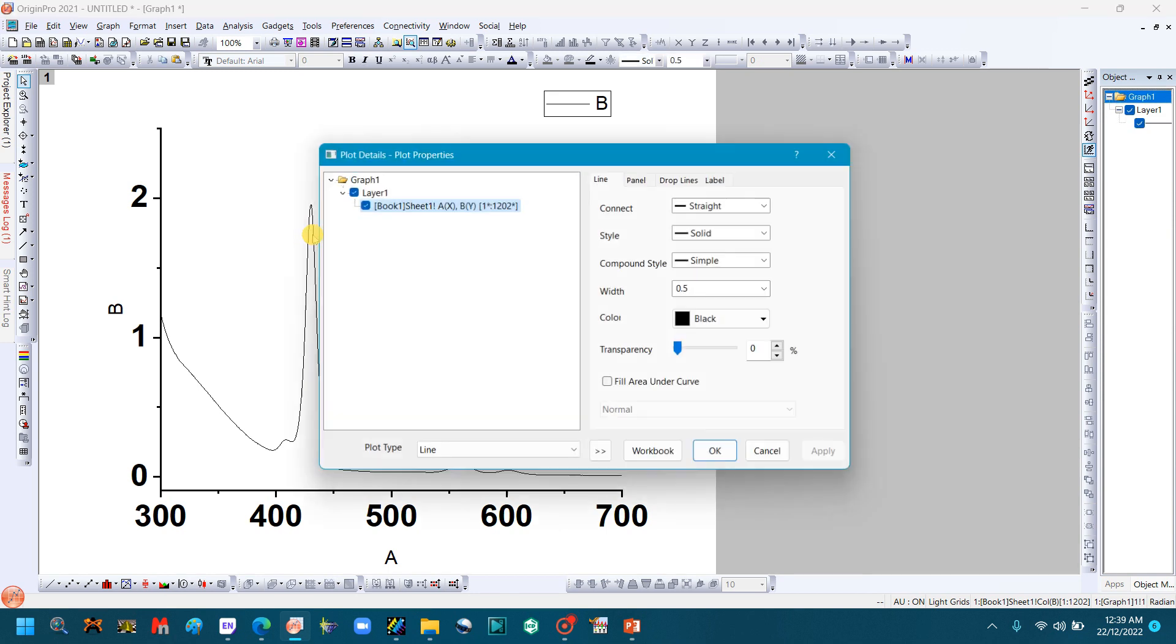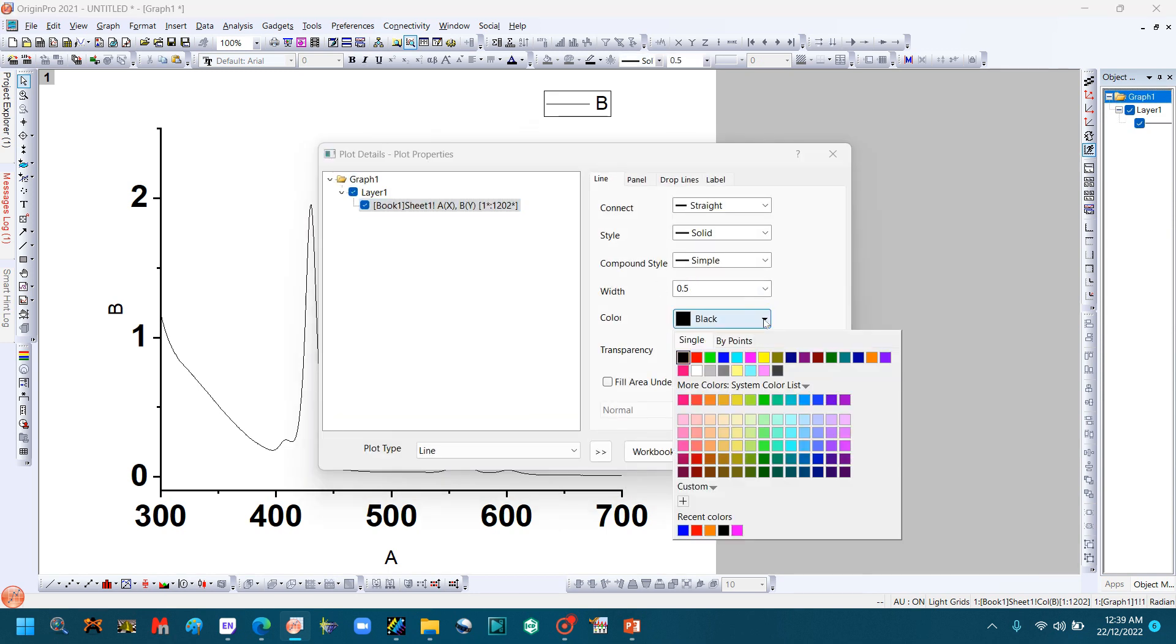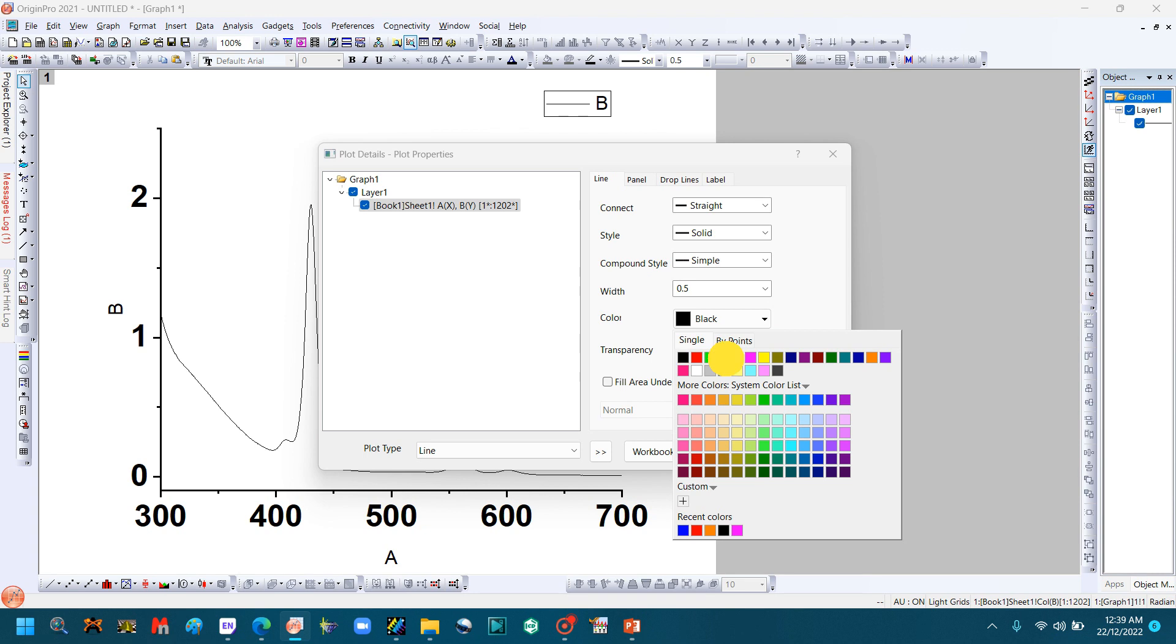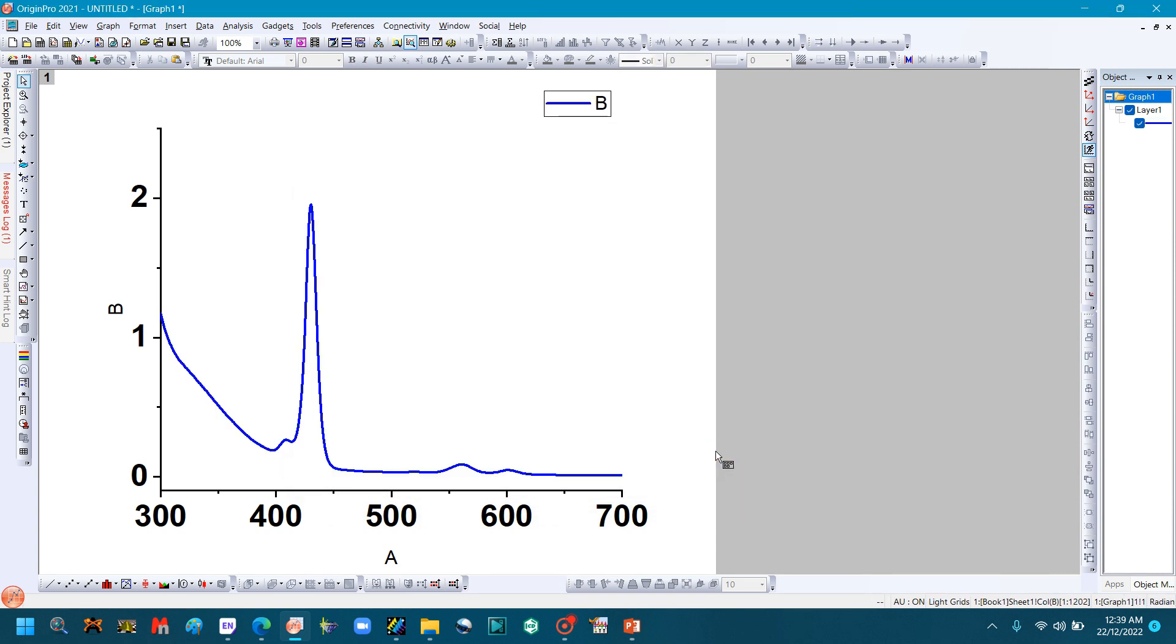Double-click the graph to change its color. Click here and set width to 3, which looks good. Click OK. You can also change the variable names here.